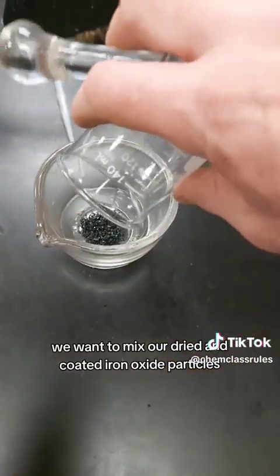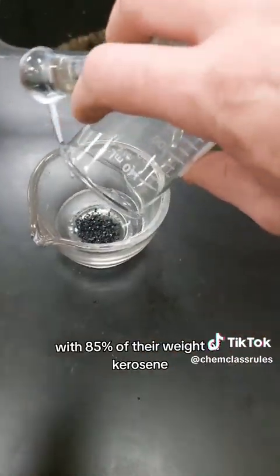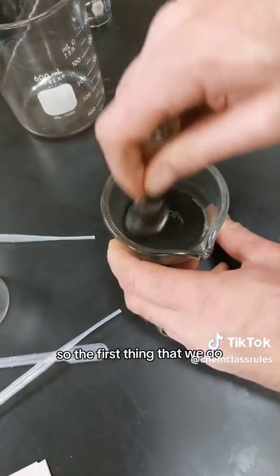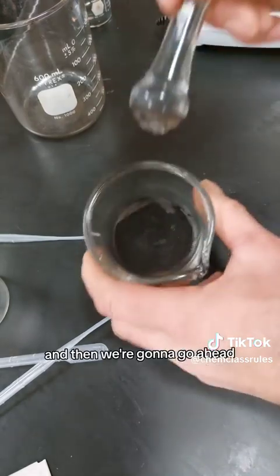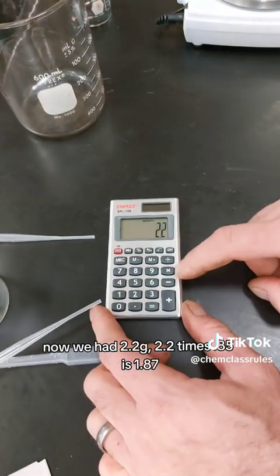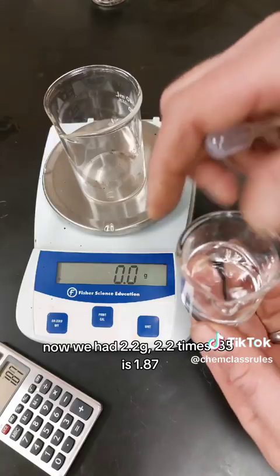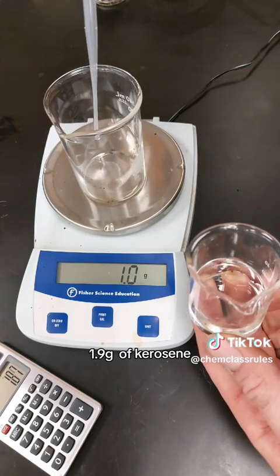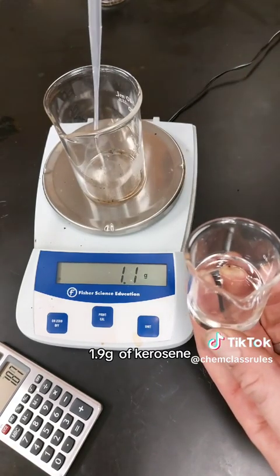Now we want to mix our dried and coated iron oxide particles with 85% of their weight in kerosene. First, take the mass of your product and crush it to a fine powder in a mortar and pestle. We had 2.2 grams — 2.2 times 0.85 is 1.87 — so we're going to add 1.9 grams of kerosene.